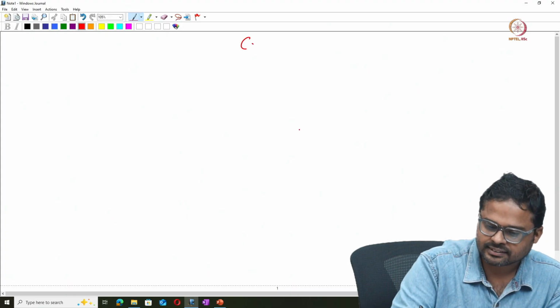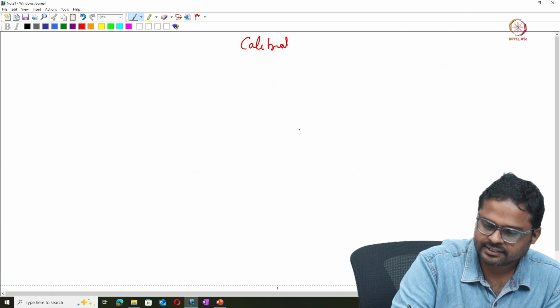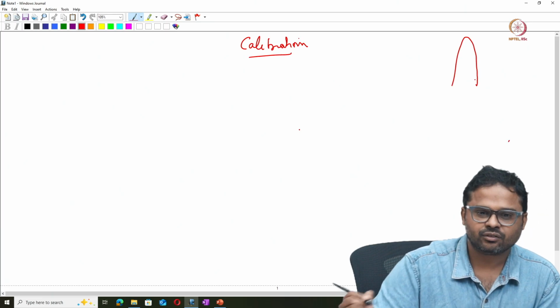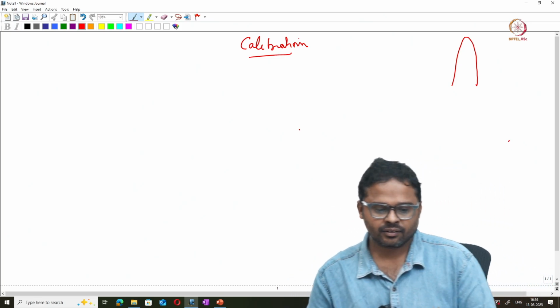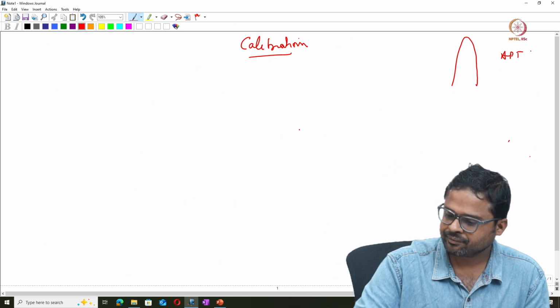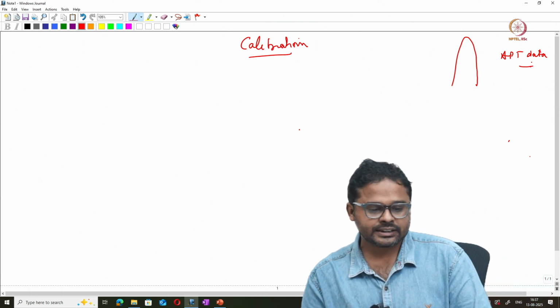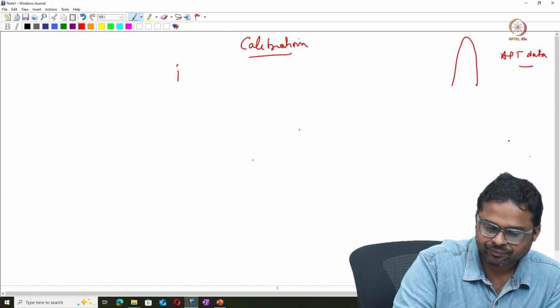In the last class we briefly reviewed the reconstruction, how to proceed with the reconstruction from the obtained data. Now in today's class I will show you some of the calibration methods which are used to calibrate the reconstruction you have done from the APT data.